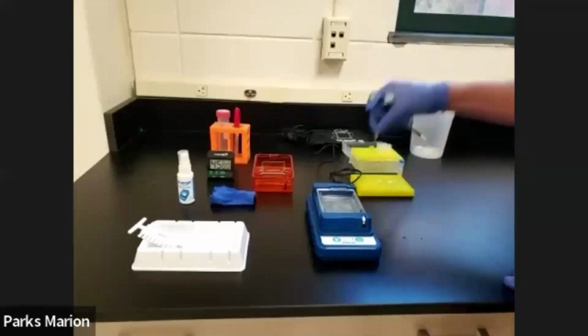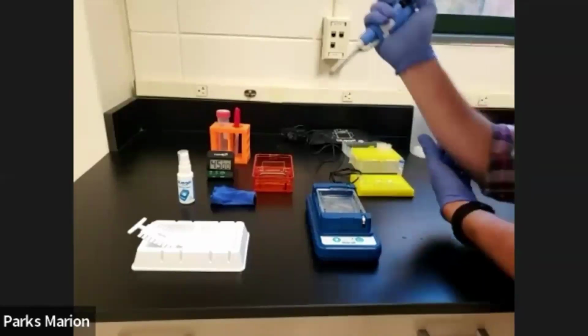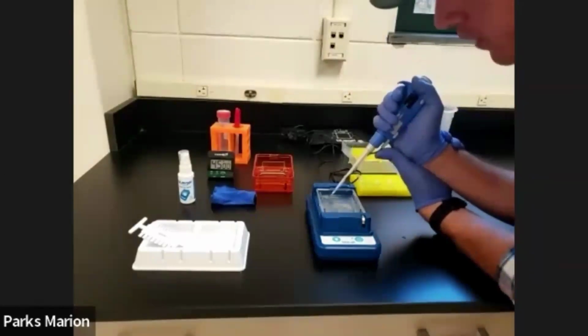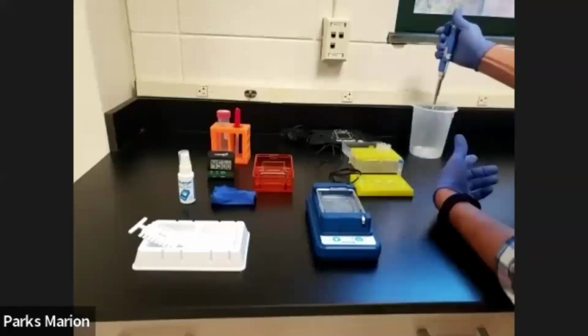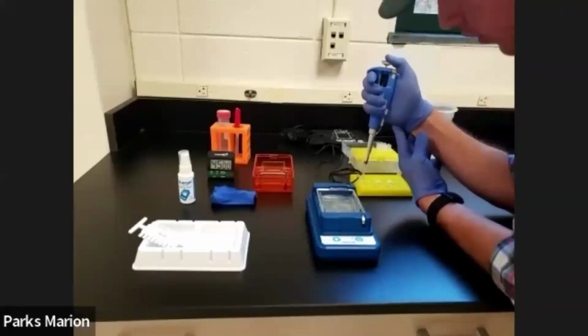The next one will be your negative control. Get our negative control here. 12 microliters of this. Again, stabilize your elbow, stabilize your hand. Don't puncture the gel. Dispense, but don't release until out of the buffer. We'll do a second well with the negative control.